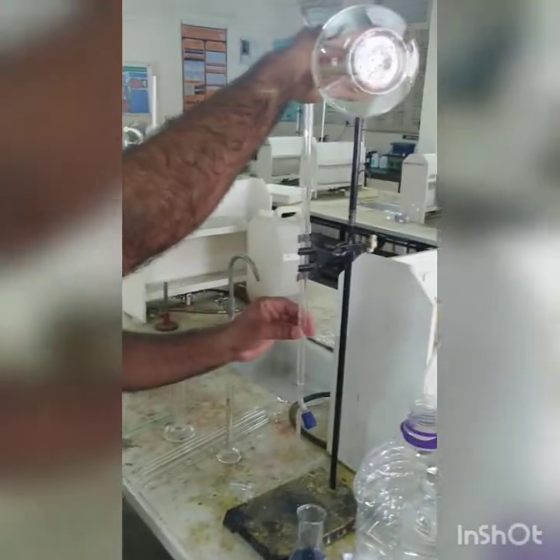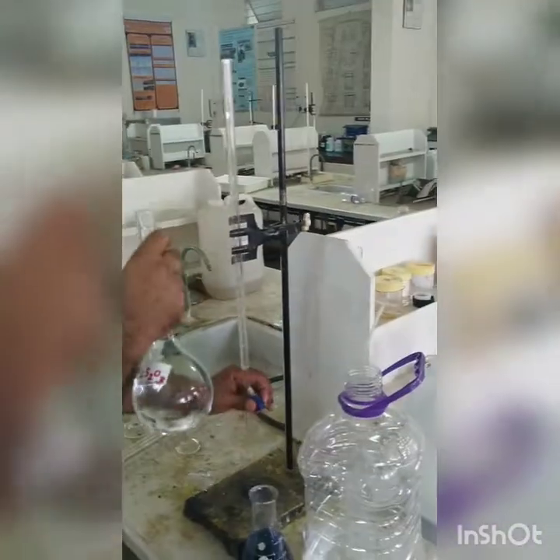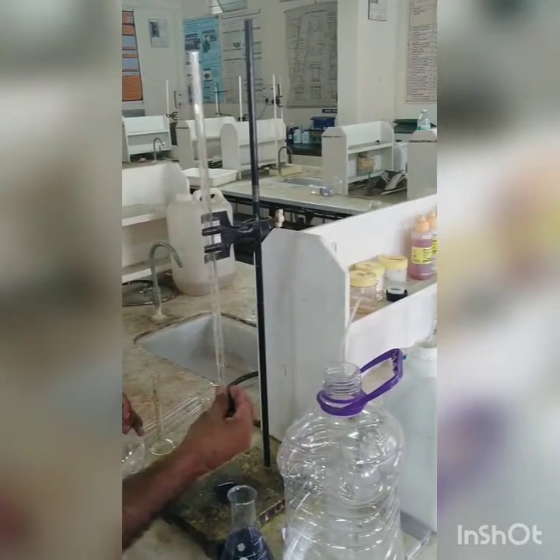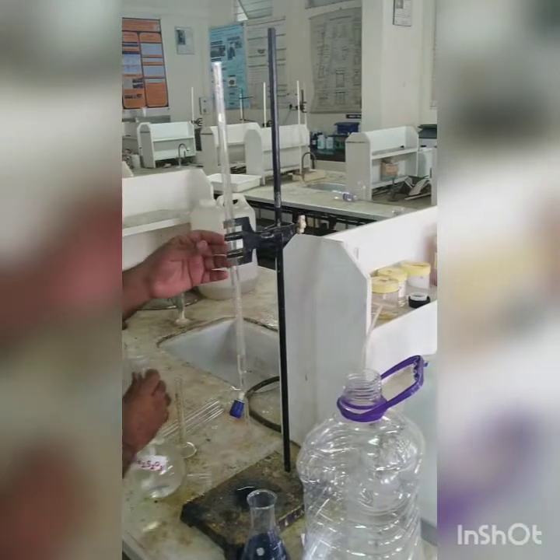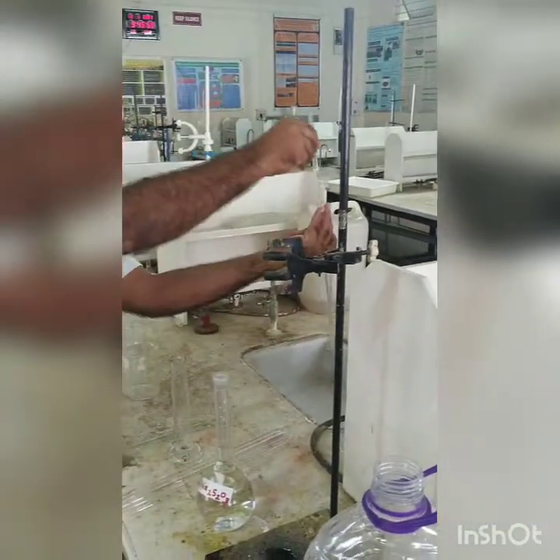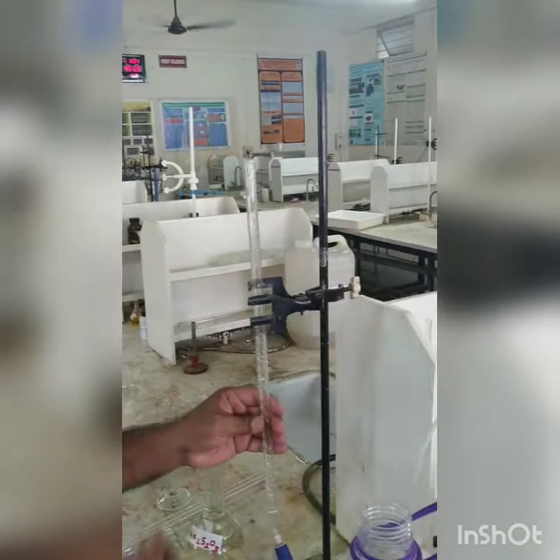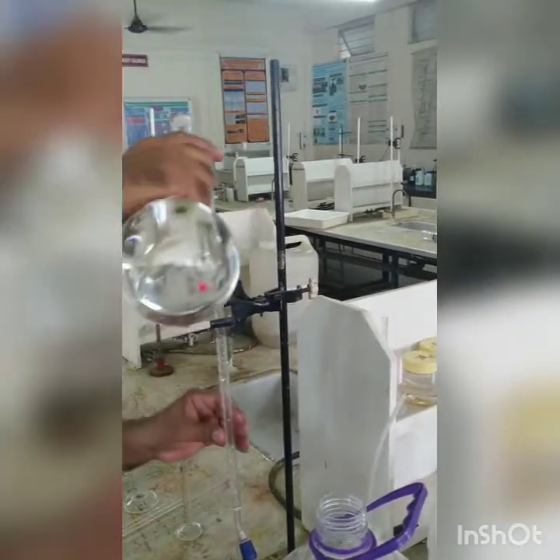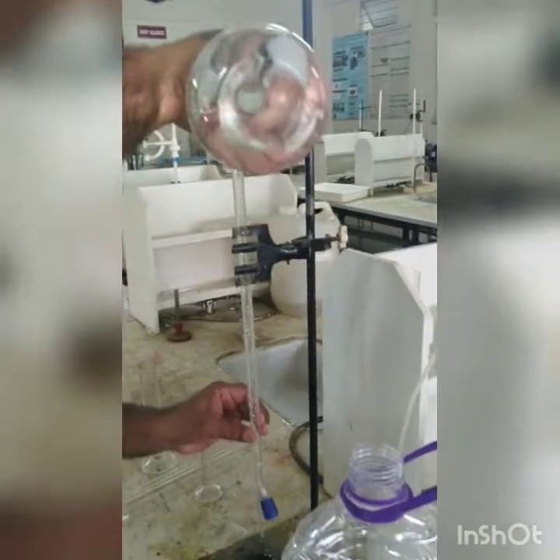So we are taking sodium thiosulfate in the burette. Ingole sir, you can rinse the burette once. First rinse the burette. So we are rinsing the burette. Take about 10 ml of sodium thiosulfate initially and drain it out from the burette.